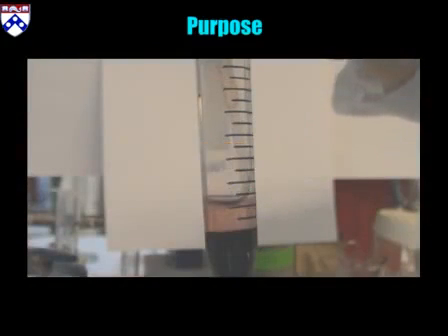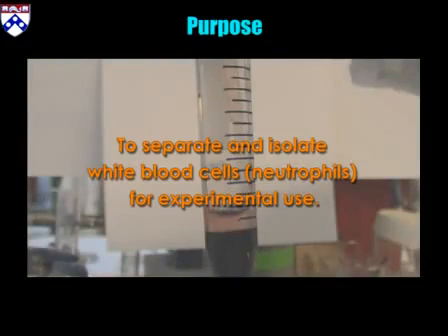Neutrophil Isolation Protocol. This procedure will extract white blood cells from a whole blood sample.